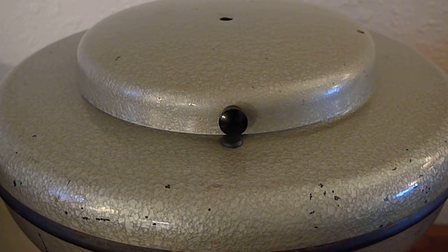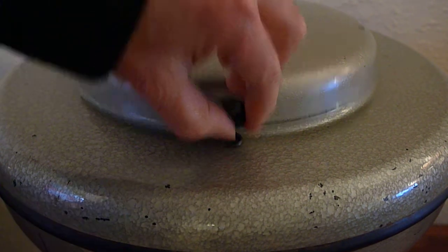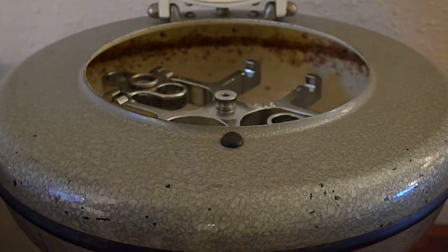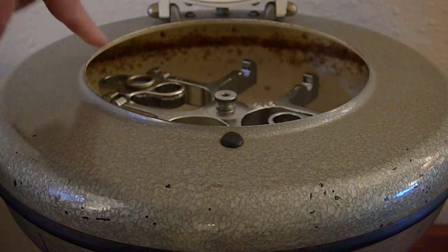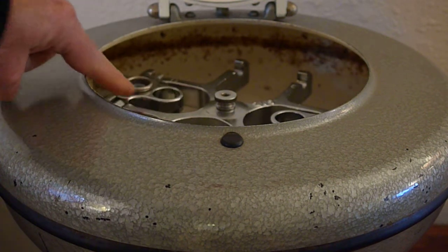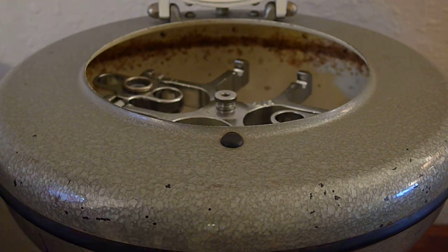Hi everybody. Today we're going to see how to calibrate a centrifuge using a cell phone. This is my centrifuge. If you look inside, you can see where the samples go. It's a swinging bucket centrifuge.